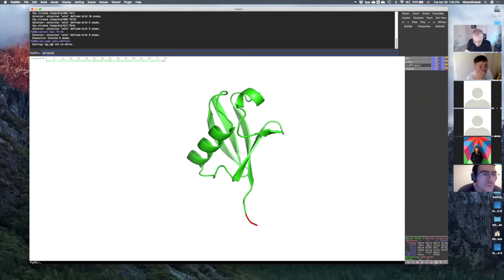SEL, lysines, comma, RESN, LYS. I'm going to repeat that again.